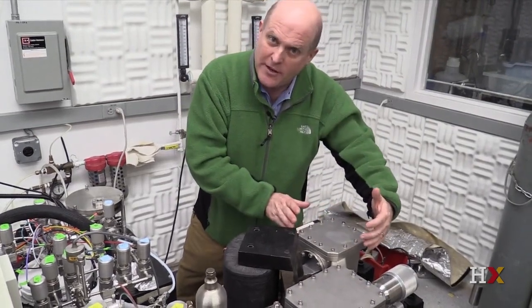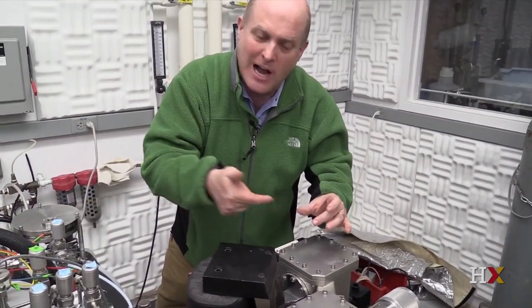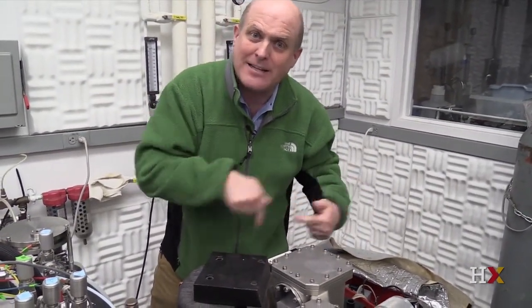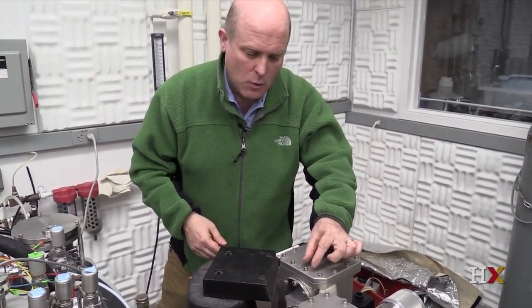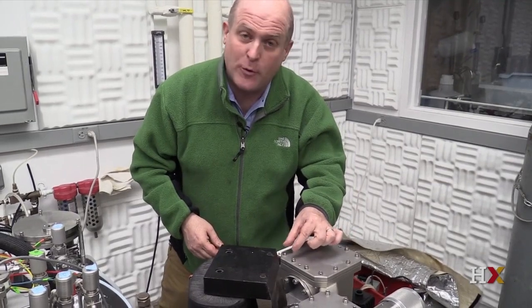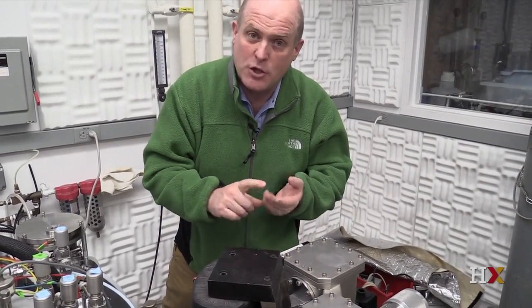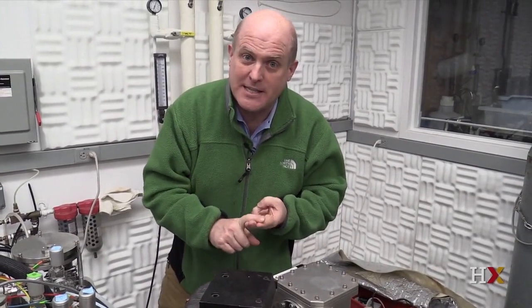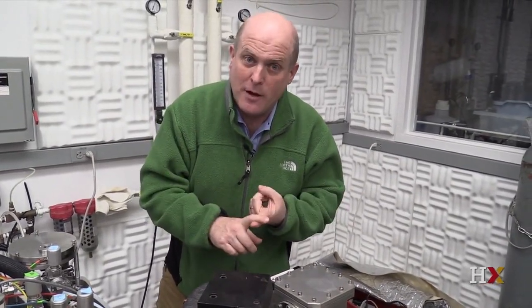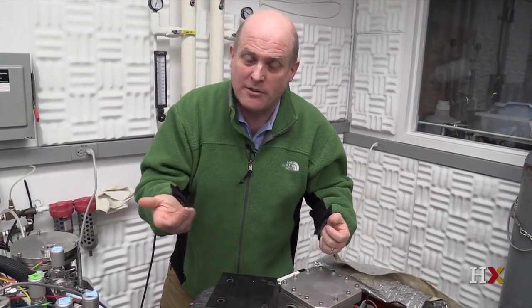And this here is what's called the collector. And these are different cups at the end that essentially count the arrival of the ions and then communicate that back to the computer. So there's 3 collectors here, one for mass 44, one for mass 45 in the middle, and one for mass 46 on the outside. Mass 44 would be for a carbon-12 and 2 oxygen-16s. Mass 45 would be carbon-13 and 2 oxygen-16s, or alternatively, a carbon-12 and oxygen-17 and an oxygen-16. And then finally, mass 46 would be a carbon-12 and an oxygen-18 and an oxygen-16.